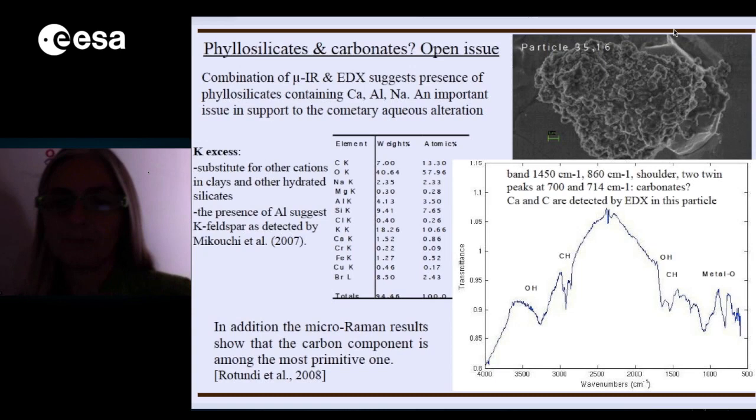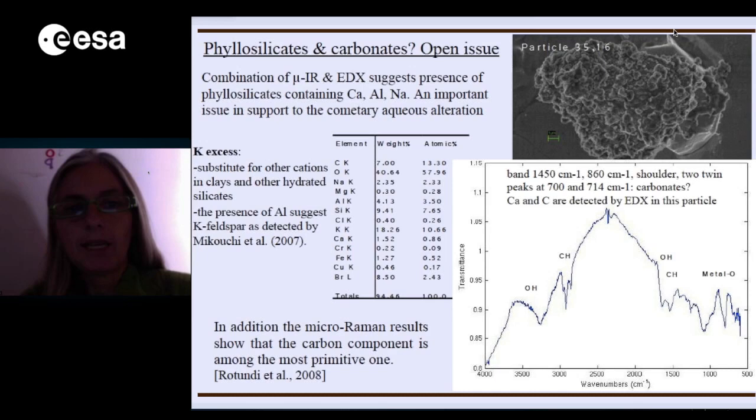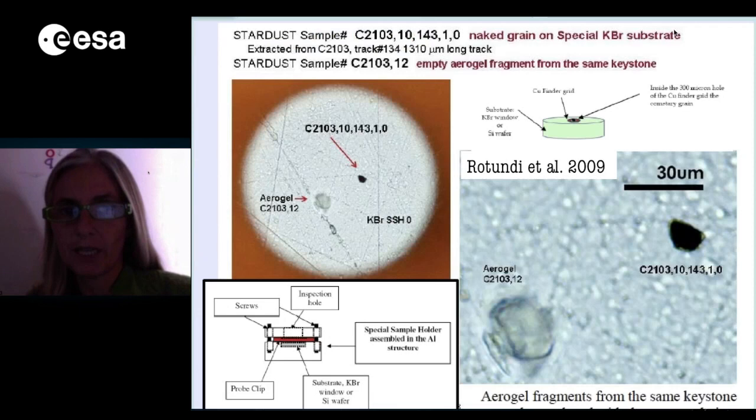Okay, here I'm showing you the grain of the second track I showed you at the very beginning, just to let you understand how samples are prepared. The techniques that we applied are non-destructive in this case. And the advantage is that after our techniques are applied, other scientists, other groups can apply further investigation with other techniques to know more about the same grain.